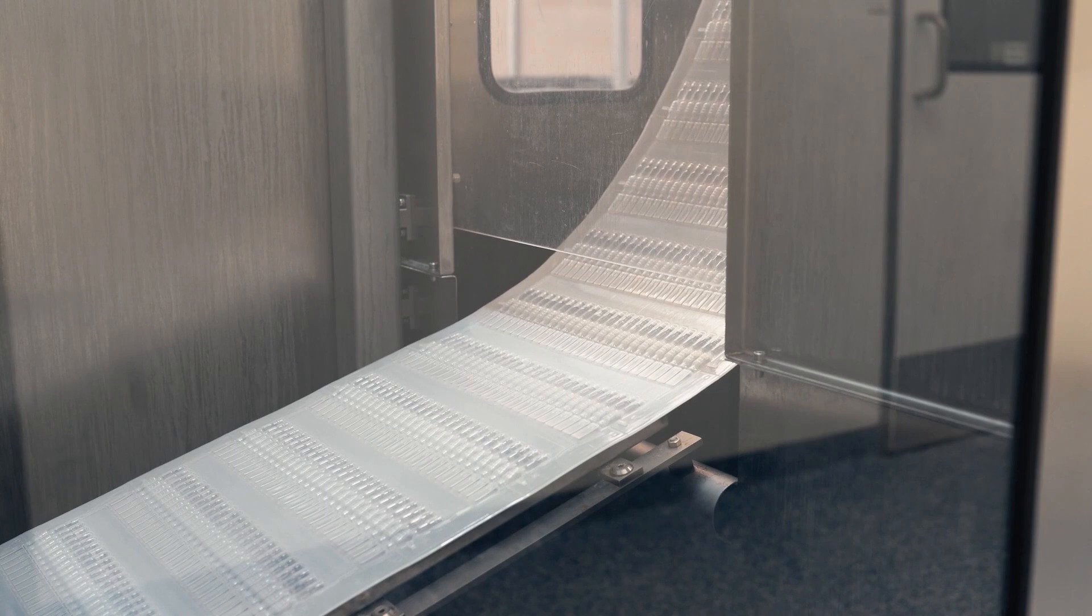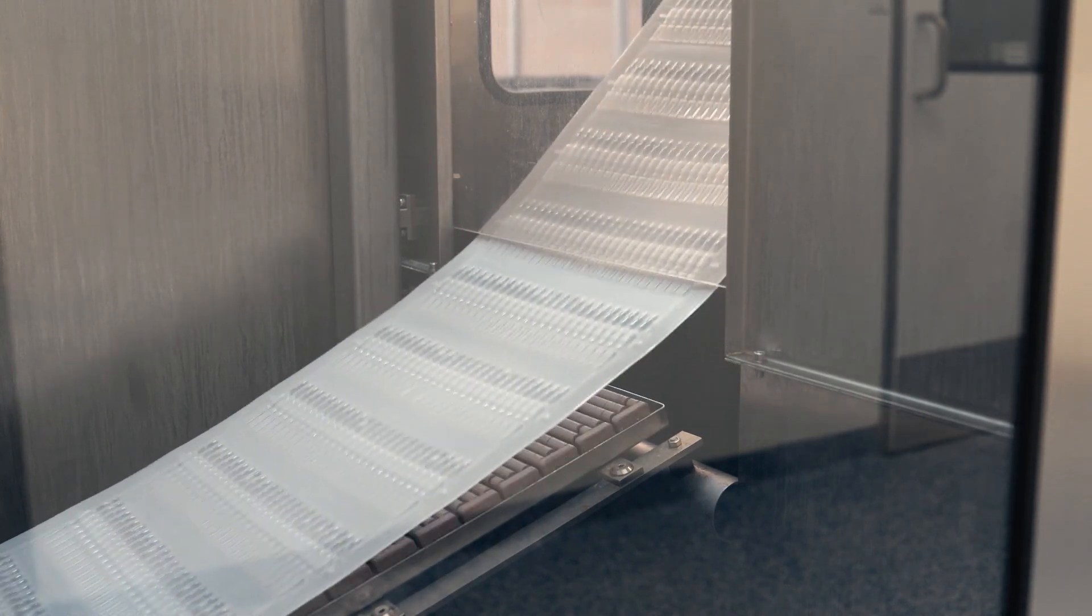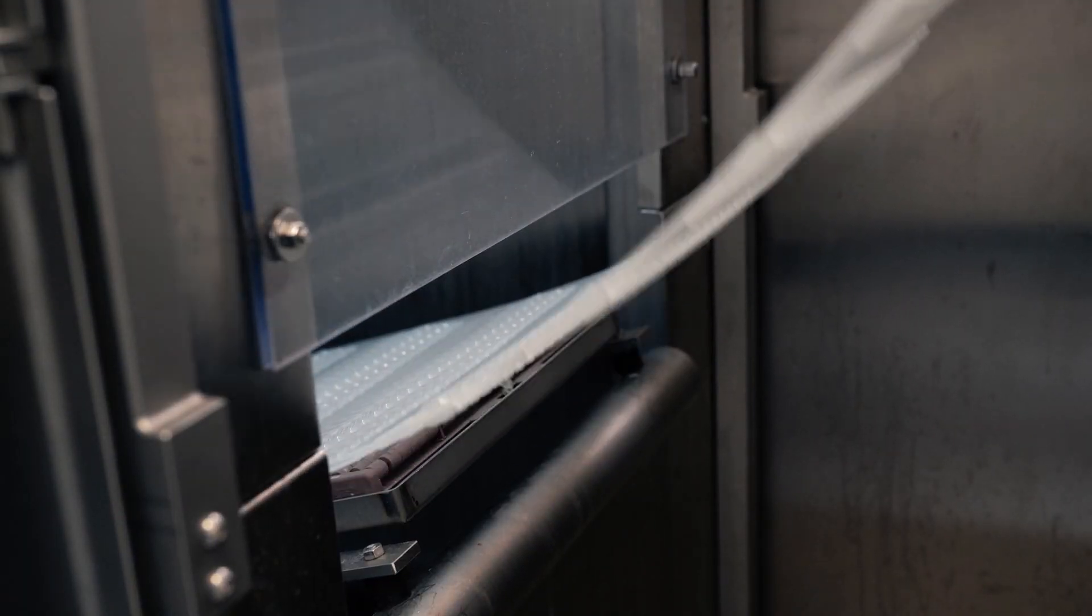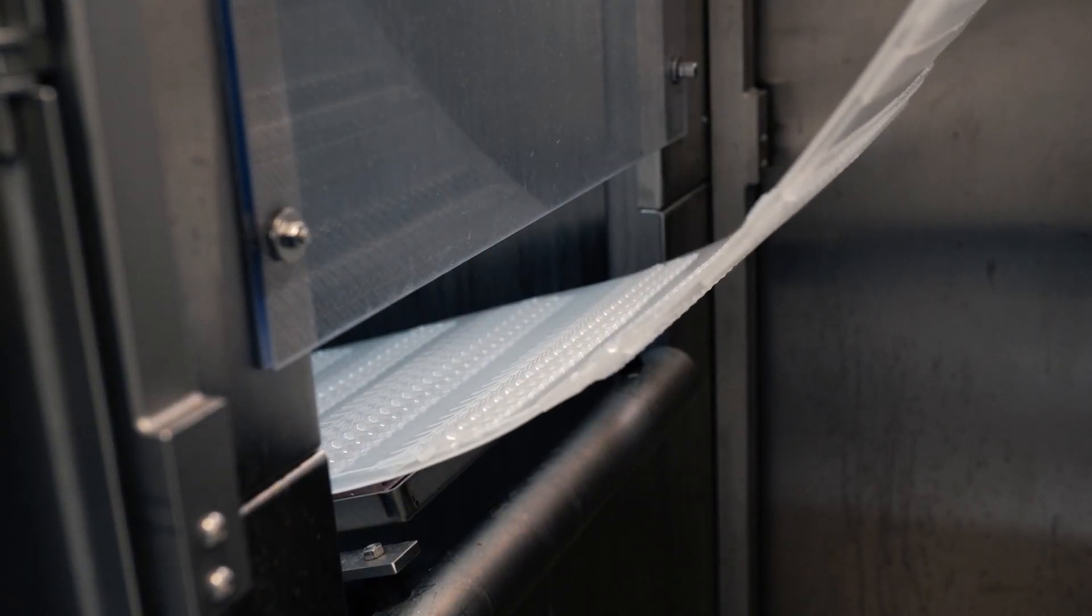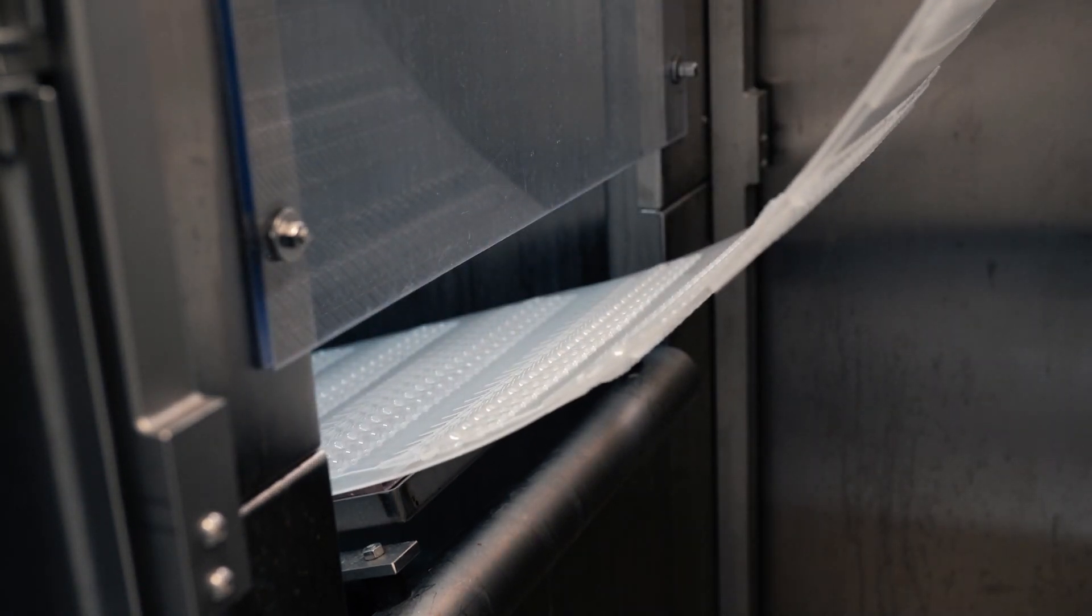The process is then repeated in successive fashion to form a ribbon of container strips exiting the BFS machine. The entire BFS process typically takes anywhere from 3 to 16 seconds per strip, depending on the machine, fill size, and other variables.